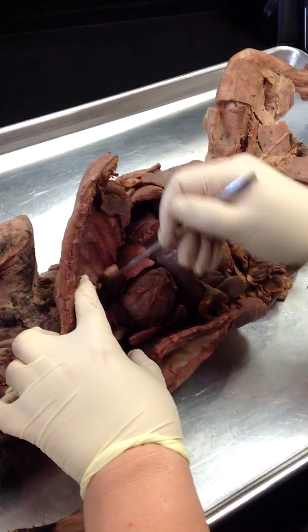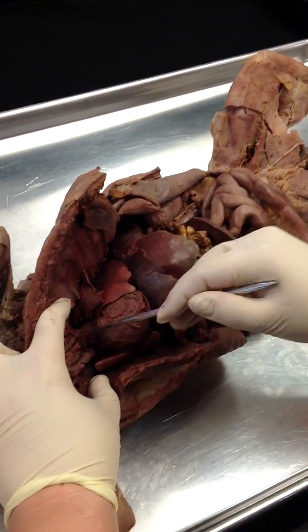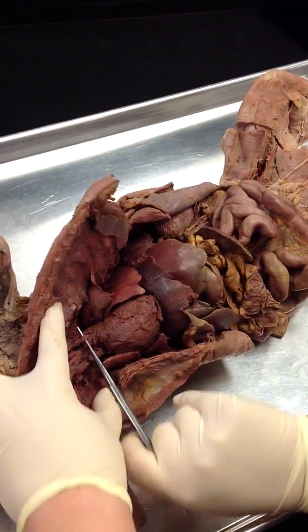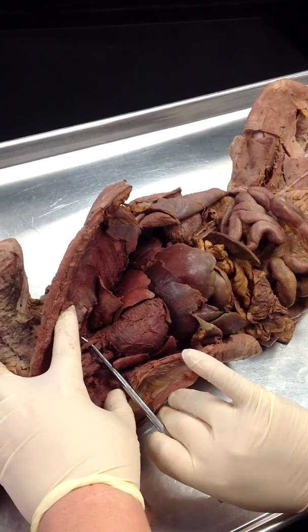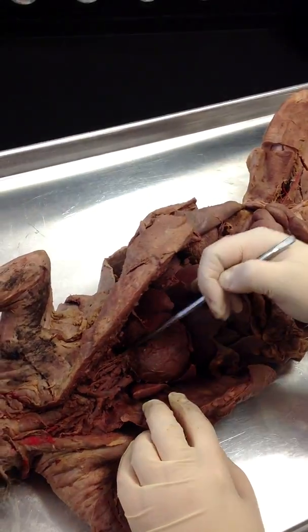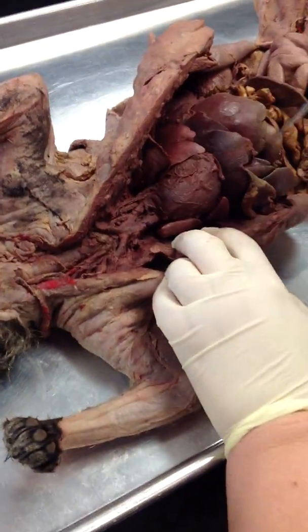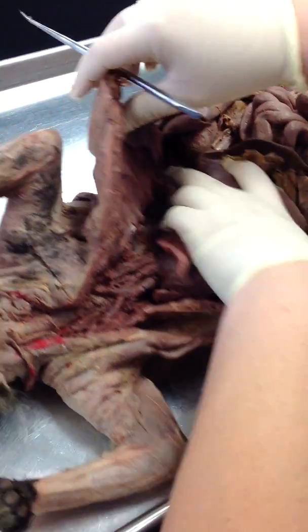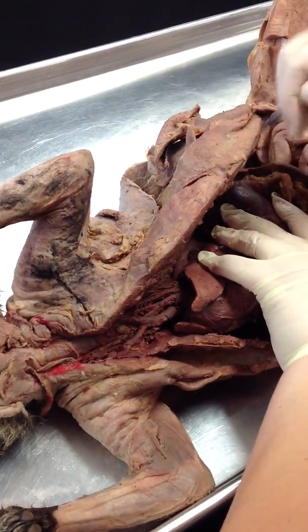And then this guy, get out of the way, lung. And then this guy down here is the left subclavian artery. Good. So those are your arteries above the heart. The aorta, you can't see the aortic arch because it's so tightly attached to the heart. So to find the aorta, you gotta sort of go like that.